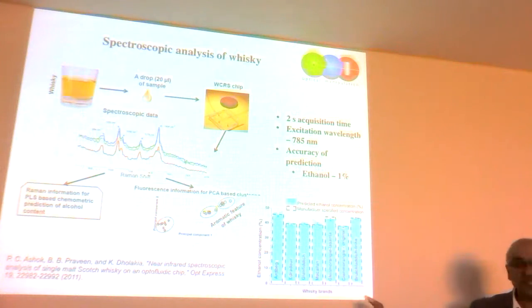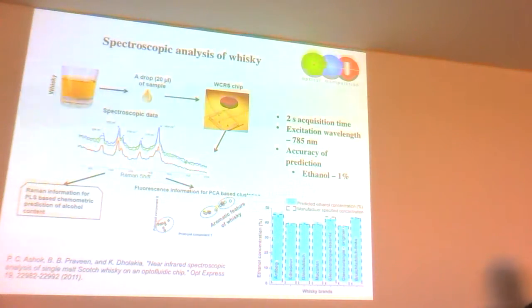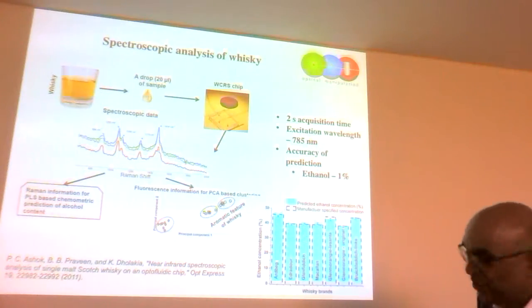So there's the alcohol content. We could actually measure it to 1%, even just on 50 samples. And that's very, very important, and that's what led on to the toxicity study, which, due to time, I'm not going to show you, but I'm very happy to show you that later. But what I am going to show you is this.